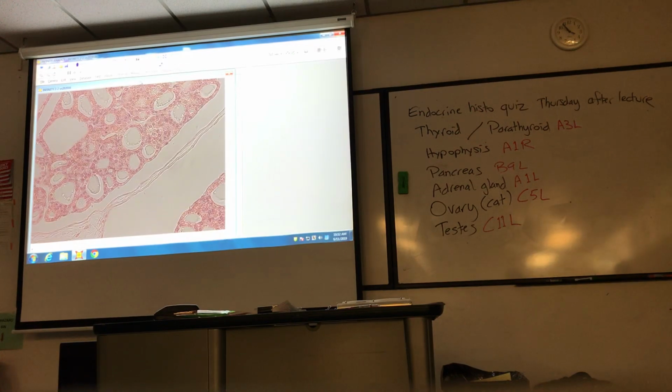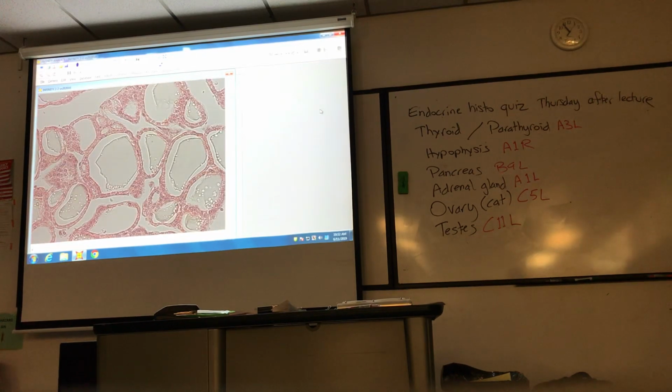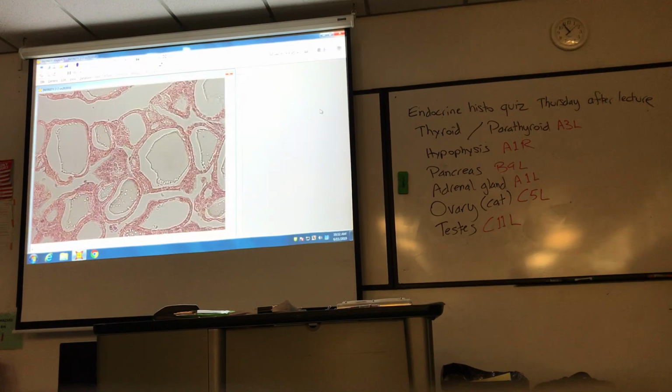Focus. White balance that. A little bit. Let me scan around. Pretty good, take a picture of that.